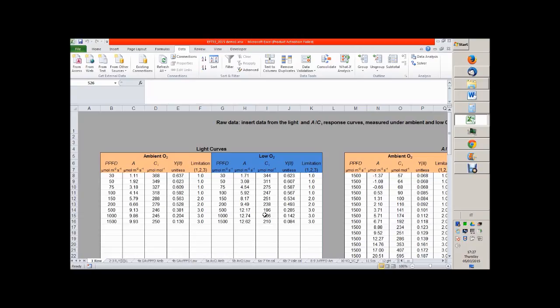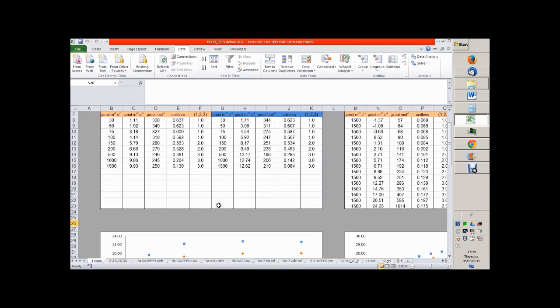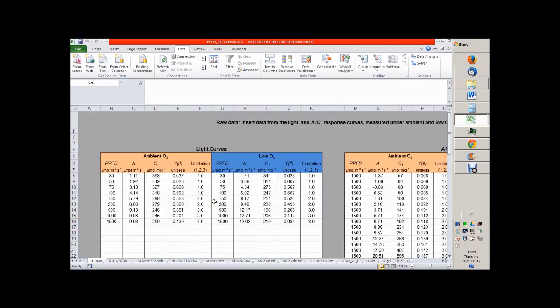Hello, my name is Chandra Bellasio, and in this video I'm showing you the general features of this Excel fitting tool version 3.3, which will derive a comprehensive set of photosynthetic parameters from gas exchange data obtained under ambient and low oxygen.